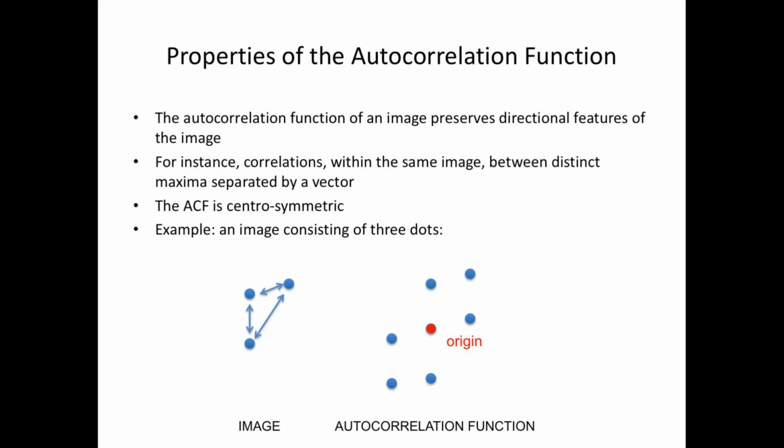Okay? So if you have 2 of these images in arbitrary translational positions, they always produce the same autocorrelation function. So if you have 2 identical ones, and they appear in different places in the image, you always wind up with this one here. So this gives us a recipe to use the autocorrelation function in order to do the rotational alignment. Because we can always do this no matter where the image is in real space.